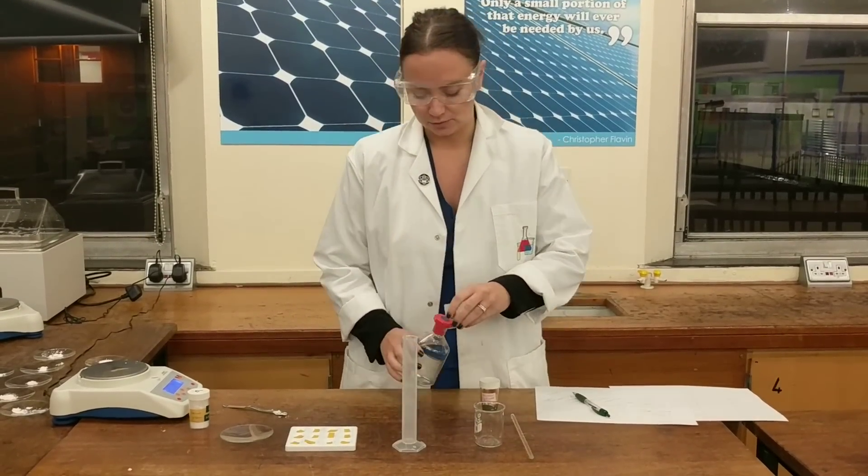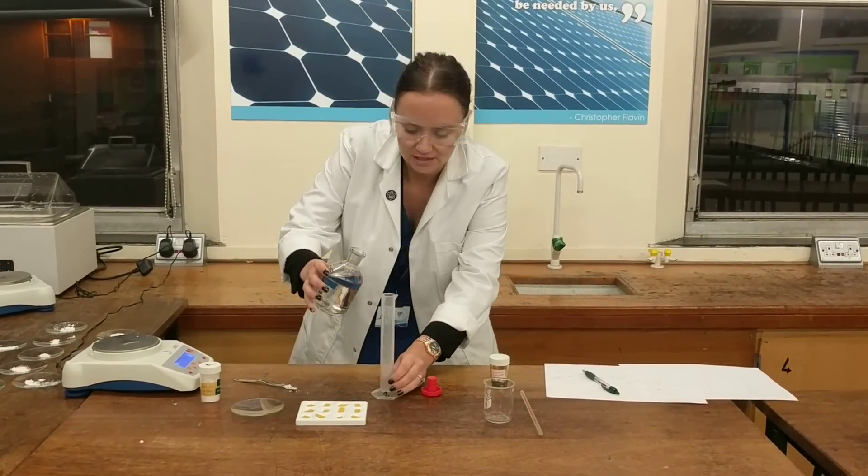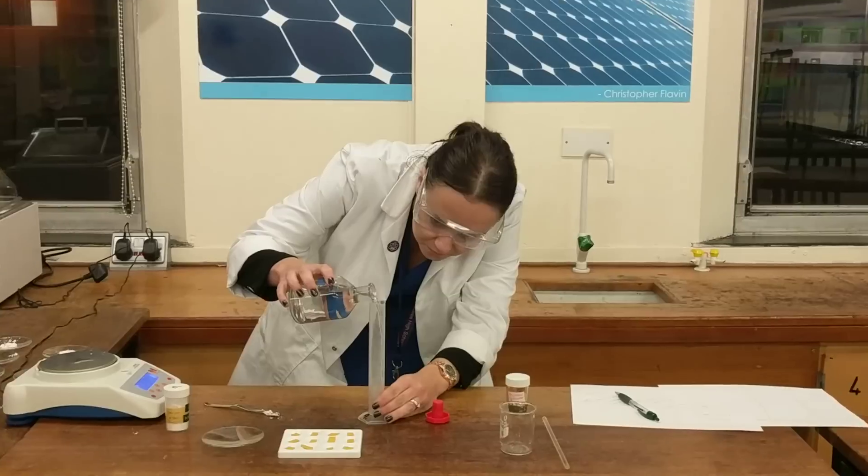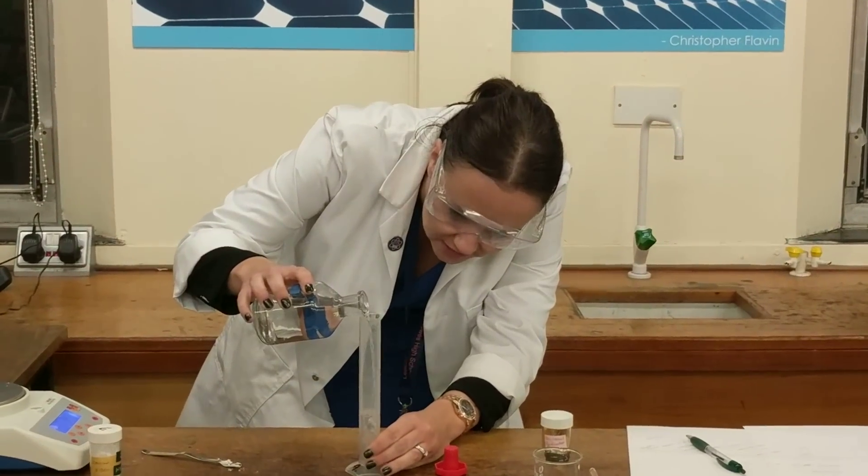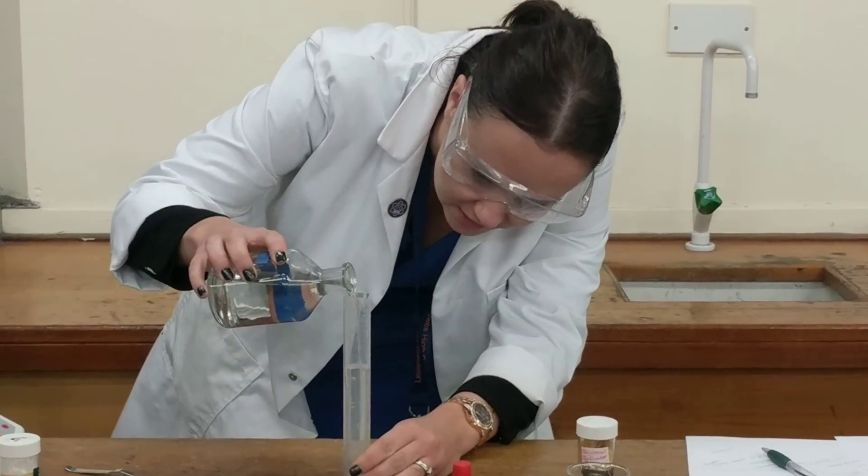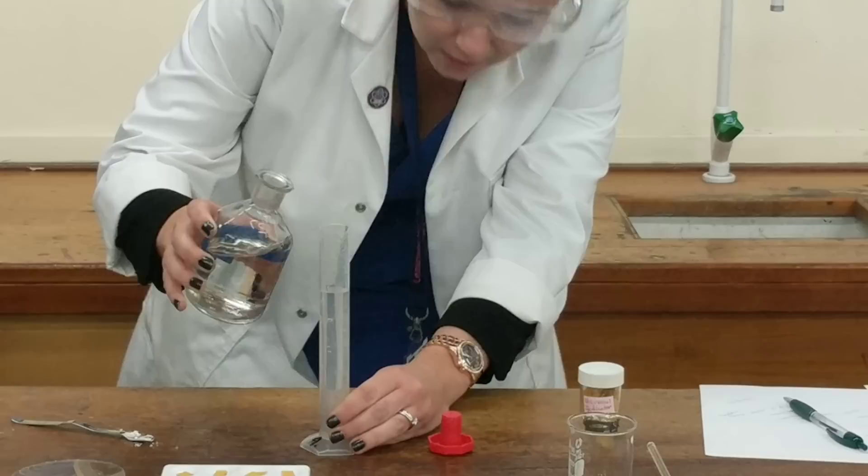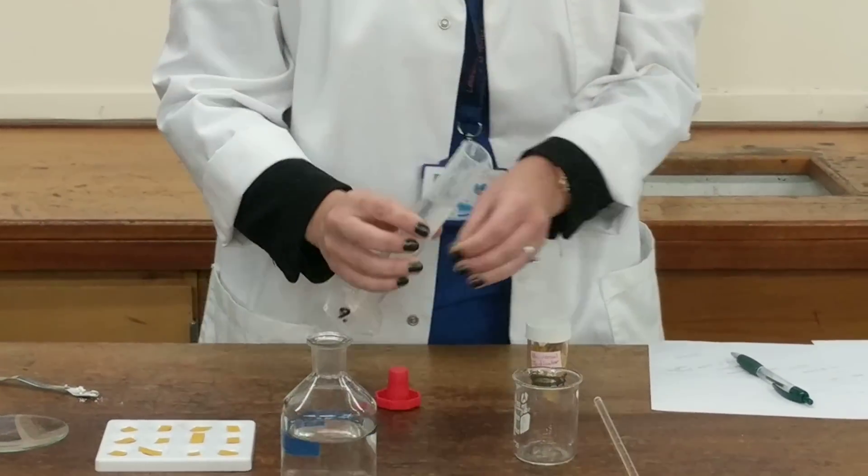So first of all we'll measure out our hydrochloric acid. We're going to be using 50 centimetre cubed, using a measuring cylinder that measures out exactly 50 centimetre cubed as this is the most accurate. And we'll put that into a beaker.